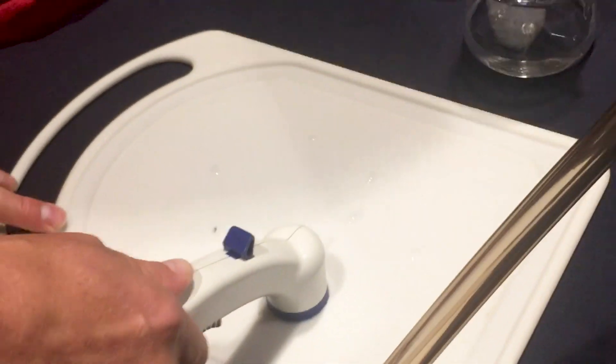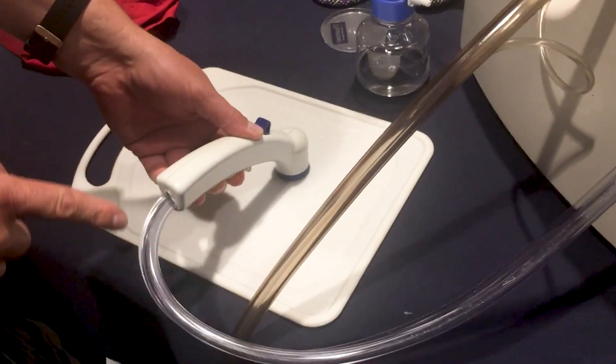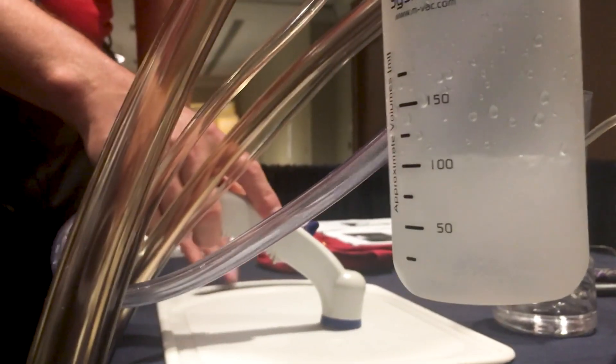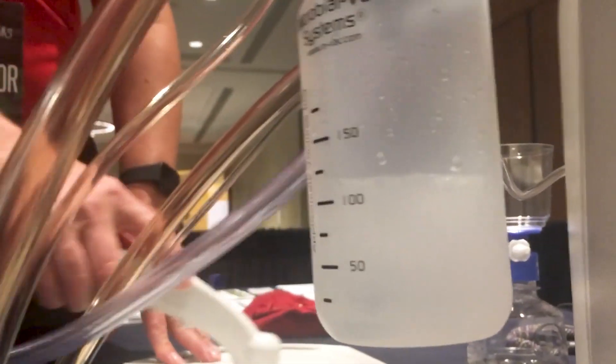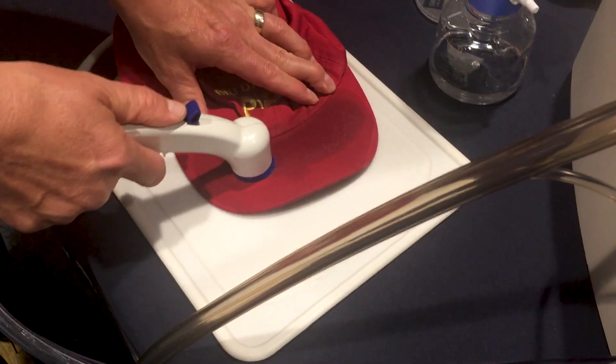And it just sucks it up. You can see it's going up through here and then it's being collected here in the bottle. Look at that. So if you want to get TouchDNA off this hat, you just put it on there and you just suck it away.